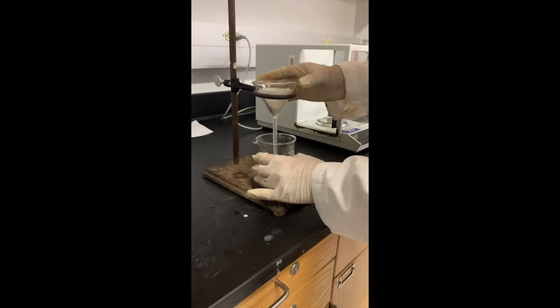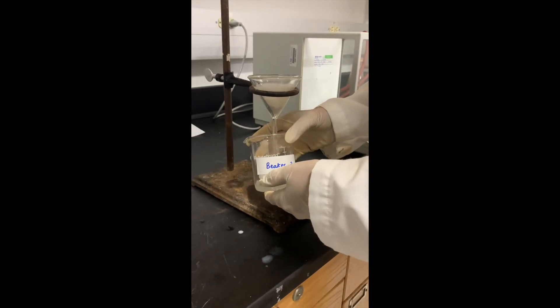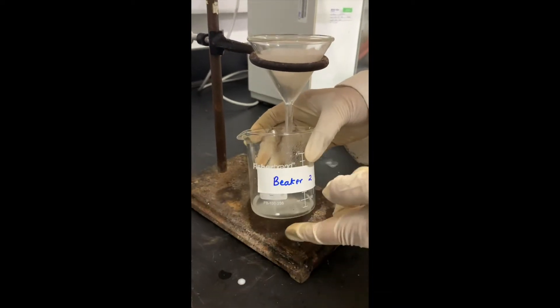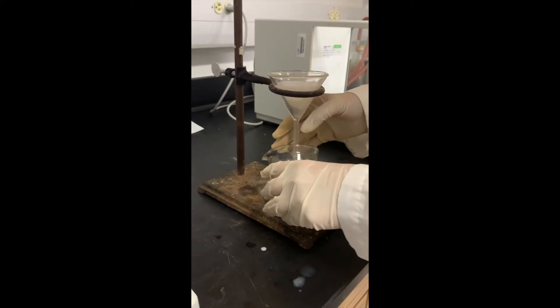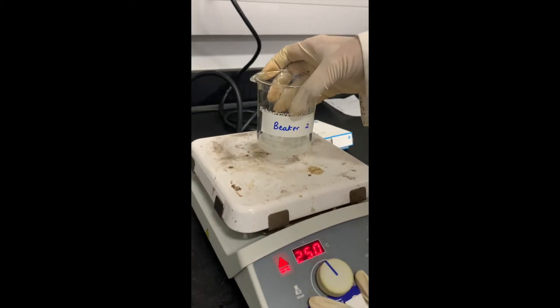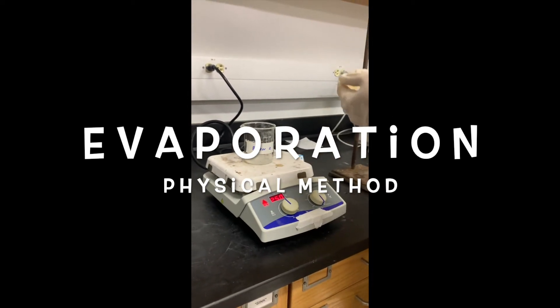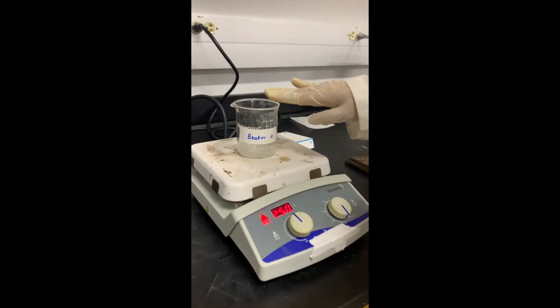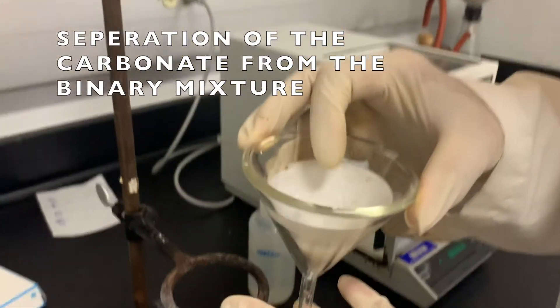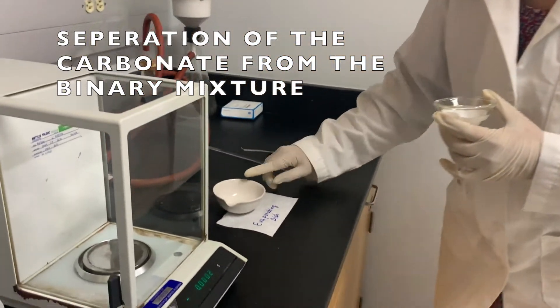Now it's almost done. Because the chloride is water soluble, it has all come off into beaker number 2, and we are going to evaporate the water from it. I already turned on the hot plate and we are going to put beaker number 2 onto the hot plate. It takes a while to get all the water evaporated. This remaining solid is the carbonate and oxide mixture.